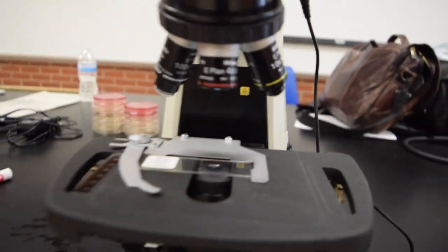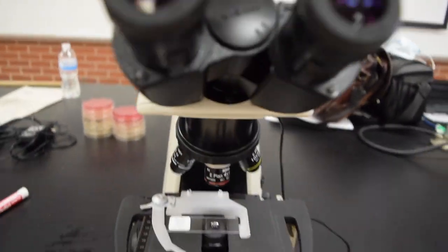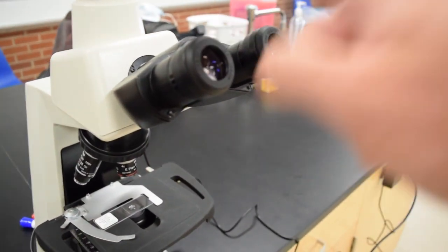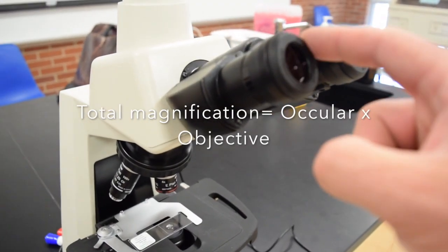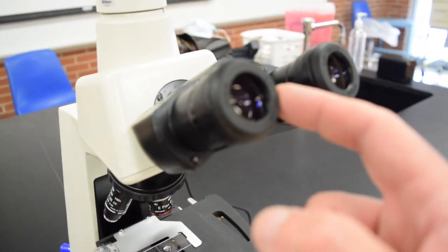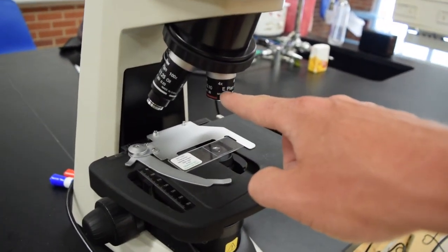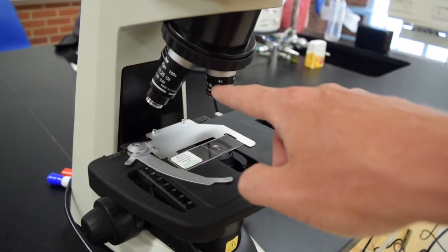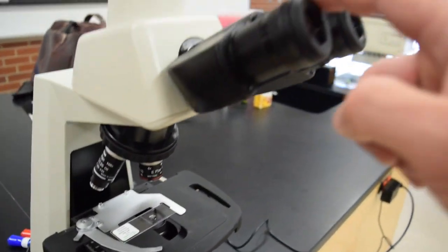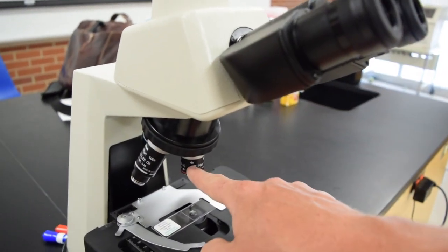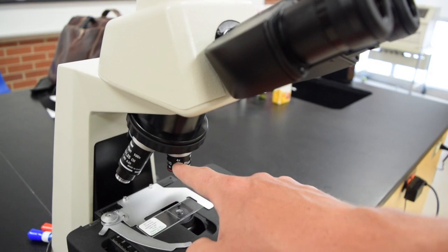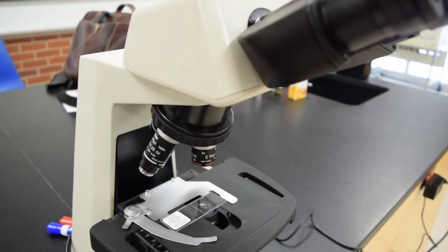Here we have the objective lenses and the ocular lenses. To get the total magnification, we use 10x magnification for the oculars and multiply that by the objective number. So this is a 4x objective: 10x times 4x equals 40 times magnification. The specimen is 40 times magnified.